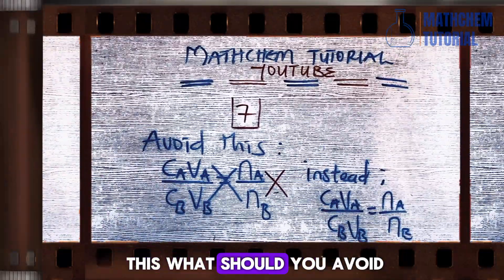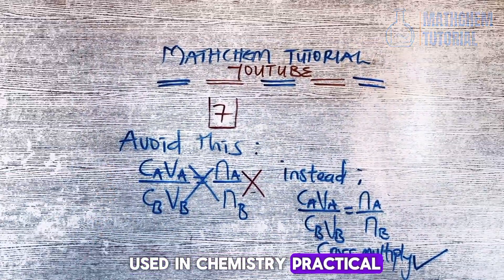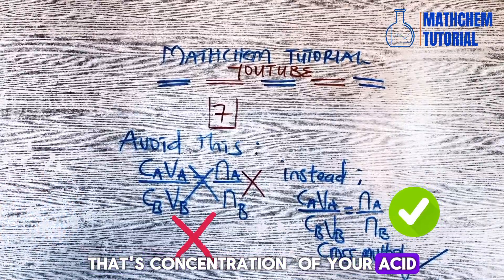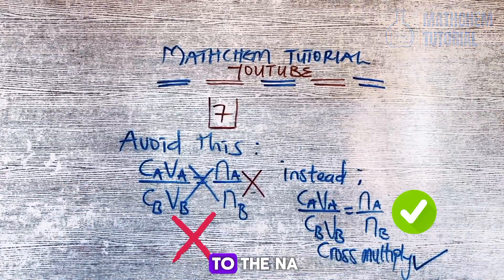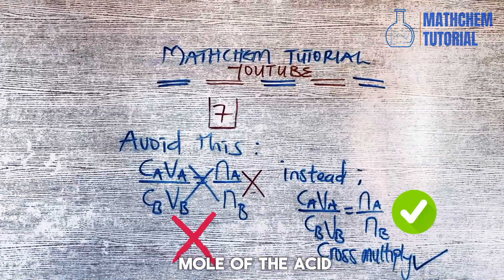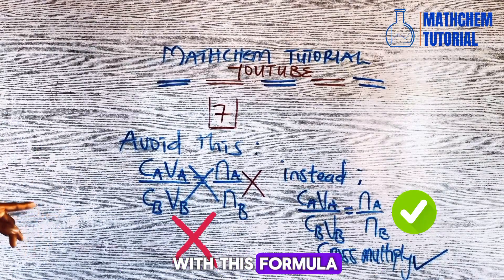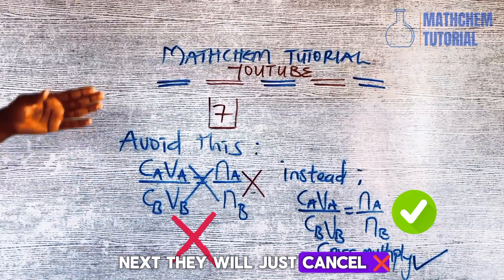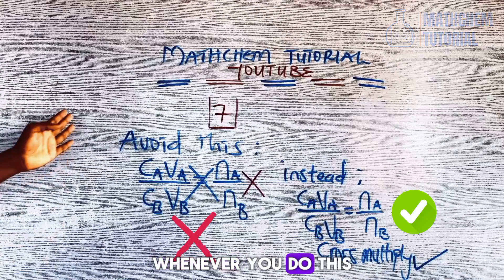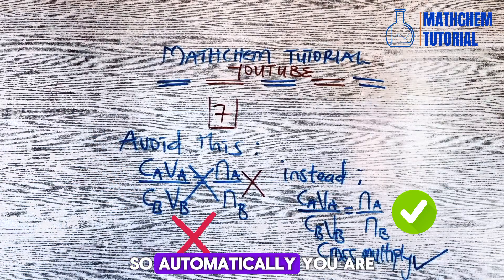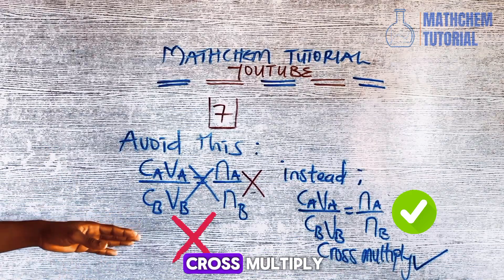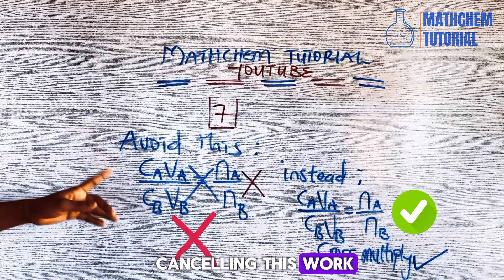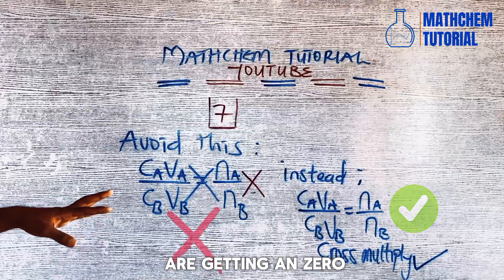Number seven: students must avoid incorrectly canceling in the titration formula. The formula used is: (Ca × Va) / (Cb × Vb) = na / nb, where Ca is concentration of acid, Va is volume of acid, Cb is concentration of base, Vb is volume of base, na is moles of acid, and nb is moles of base. Many students, after writing this formula, draw a cross-cancel sign through it thinking it means cross-multiplication — this automatically cancels your work and you score zero. Instead, write 'cross multiply' below it to show your intent, and do not draw the canceling cross sign.